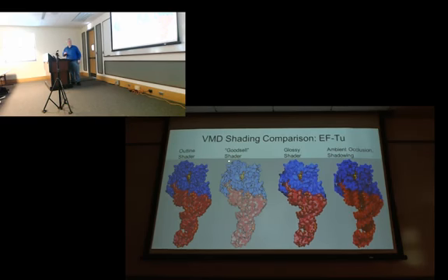This is another one that sort of mimics in a very inexpensive way the rendering style that David Goodsell likes to use. So if you look at the PDB molecule of the month, he often renders these very nice images that sort of emulate a pen and ink kind of drawing with a pastel shading of the interior. And again, this is using the outline shader in VMD combined with some very diffuse lighting.